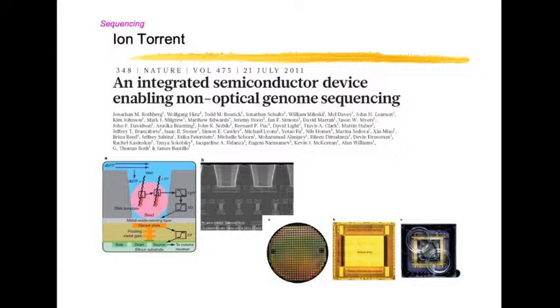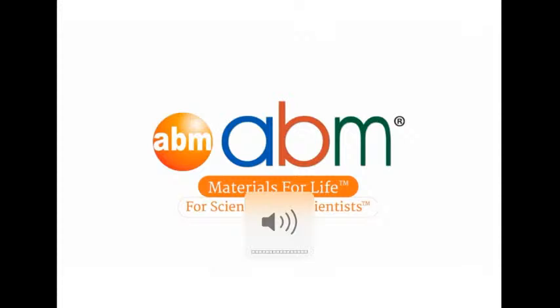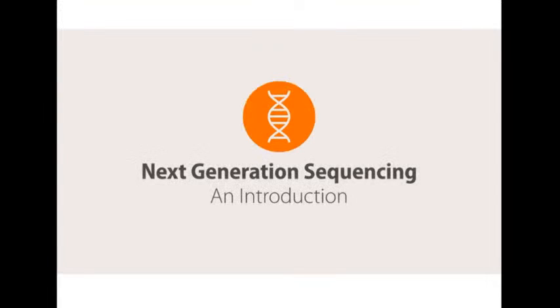So let's see this one about the various sequencers.